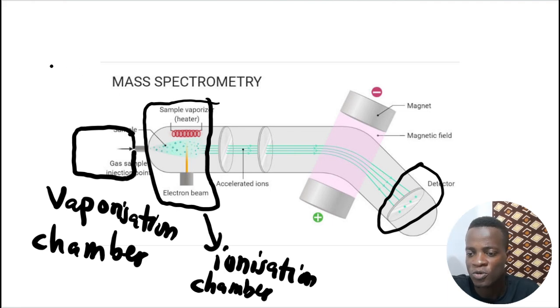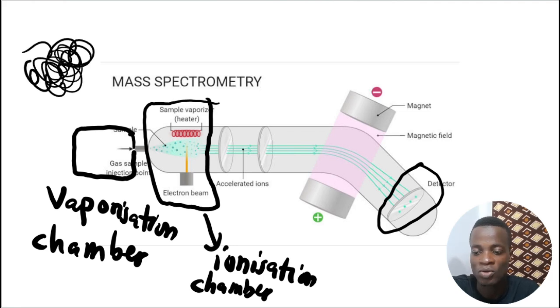That's what happens here. So let me make it bigger, right? So let's say the gaseous sample is here. It is a gaseous sample. It's an atom actually. There are a lot of atoms placed inside that gas, right? And then we have our electron gun. Let's say it's here, like shooting.